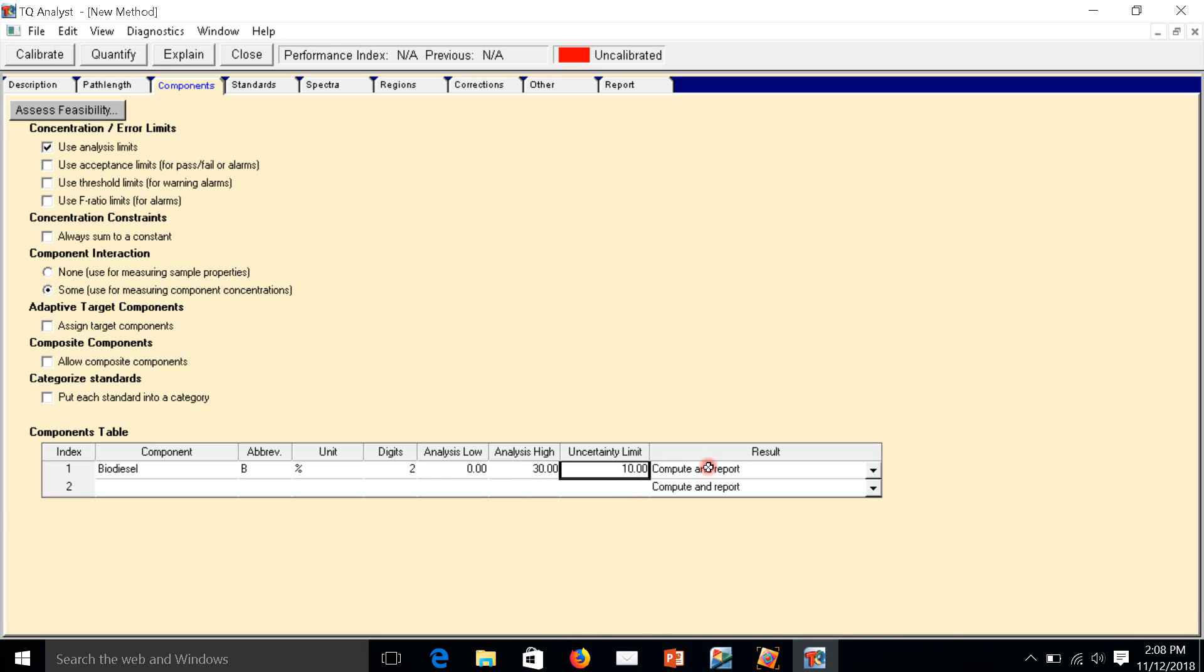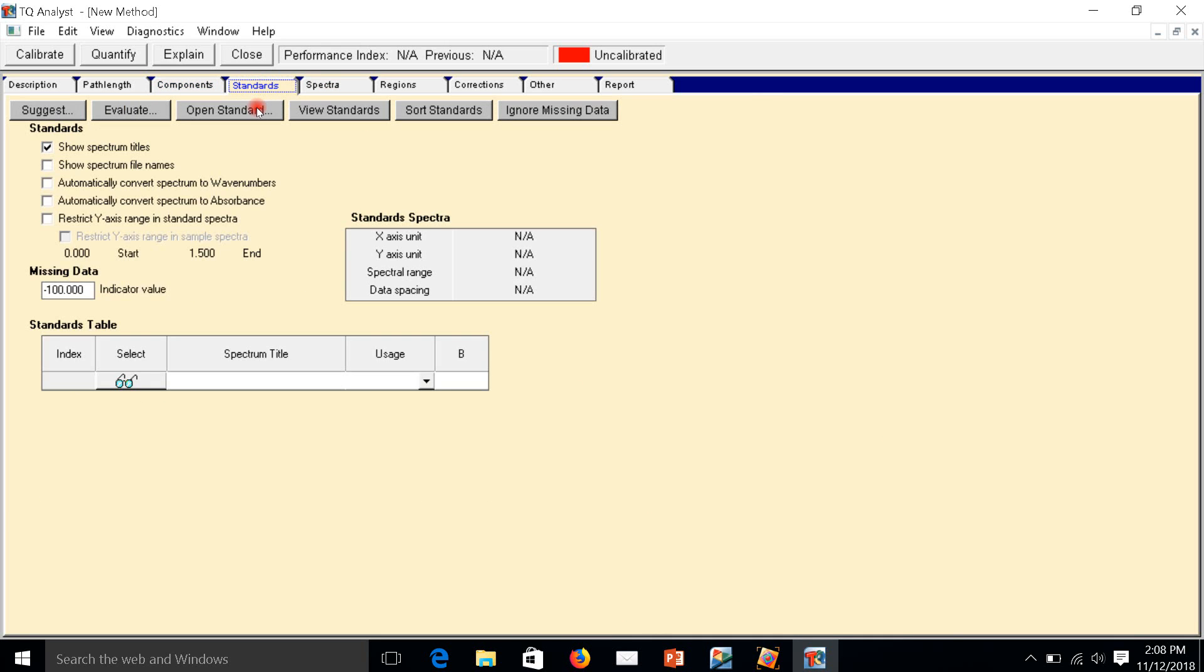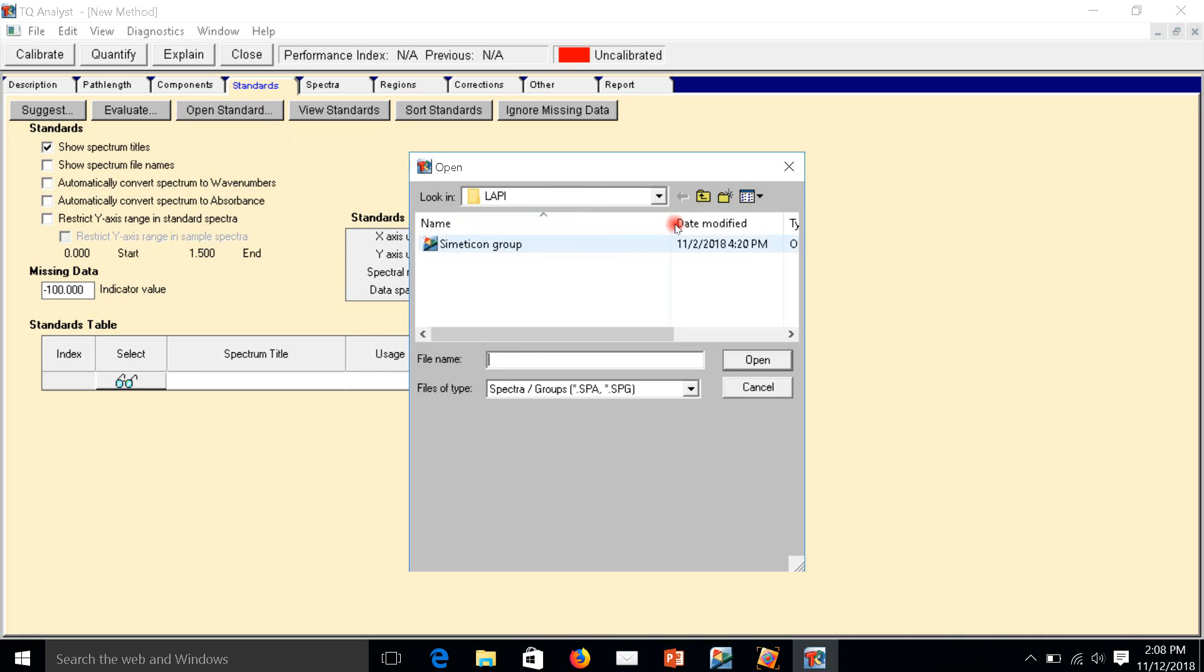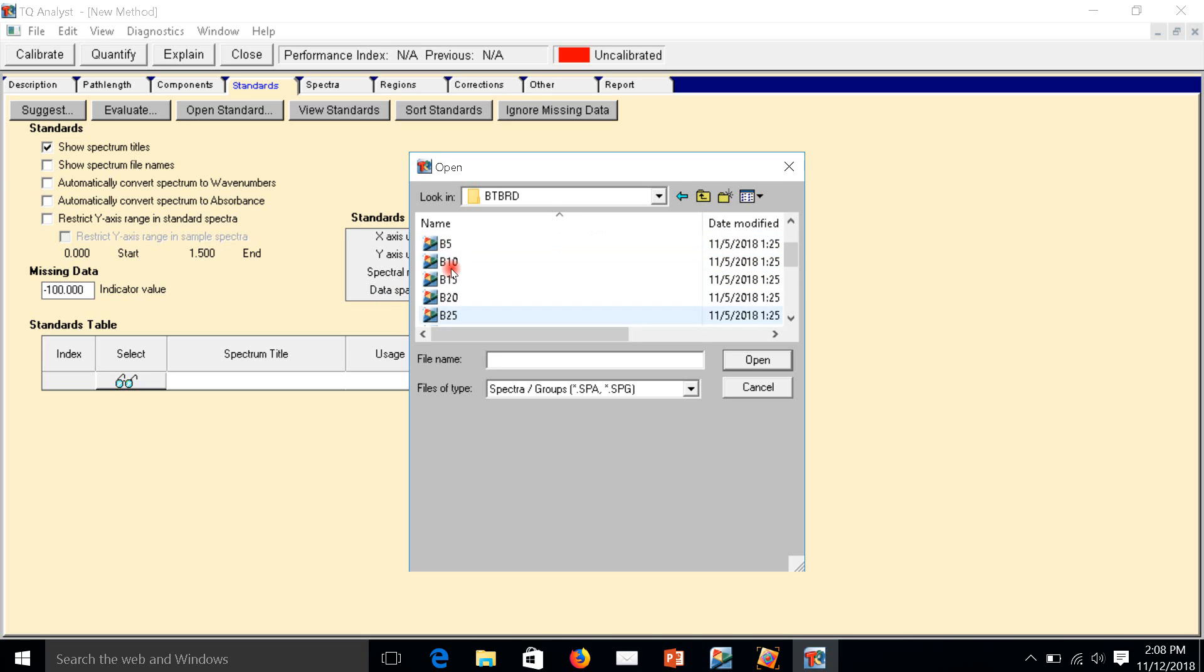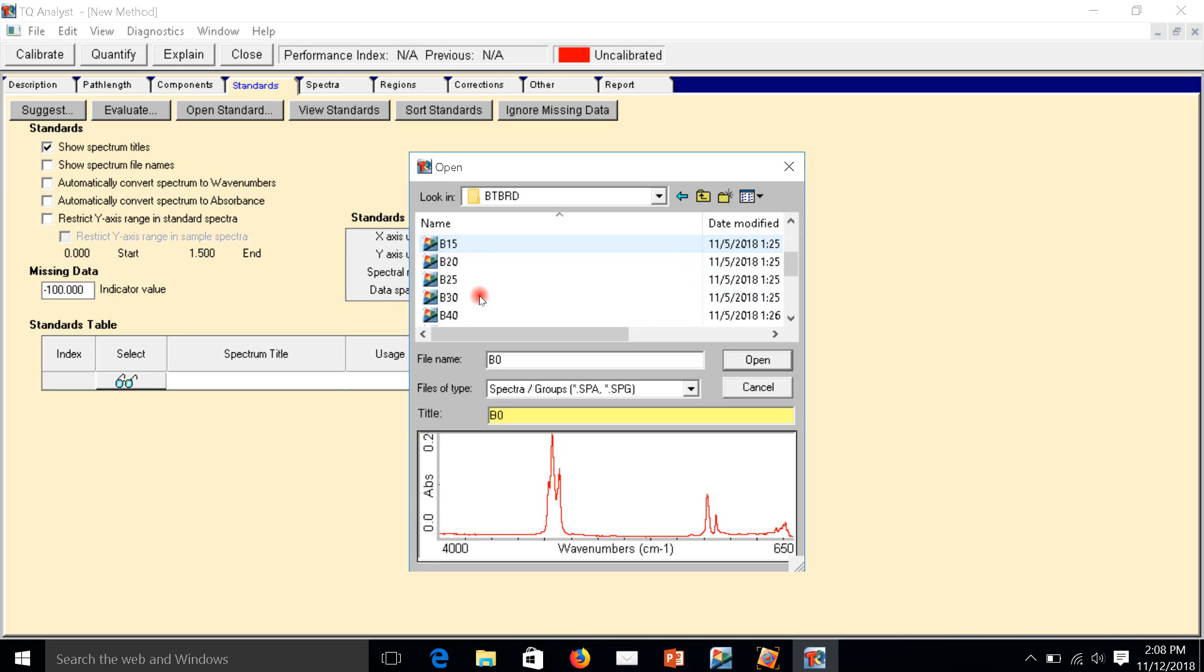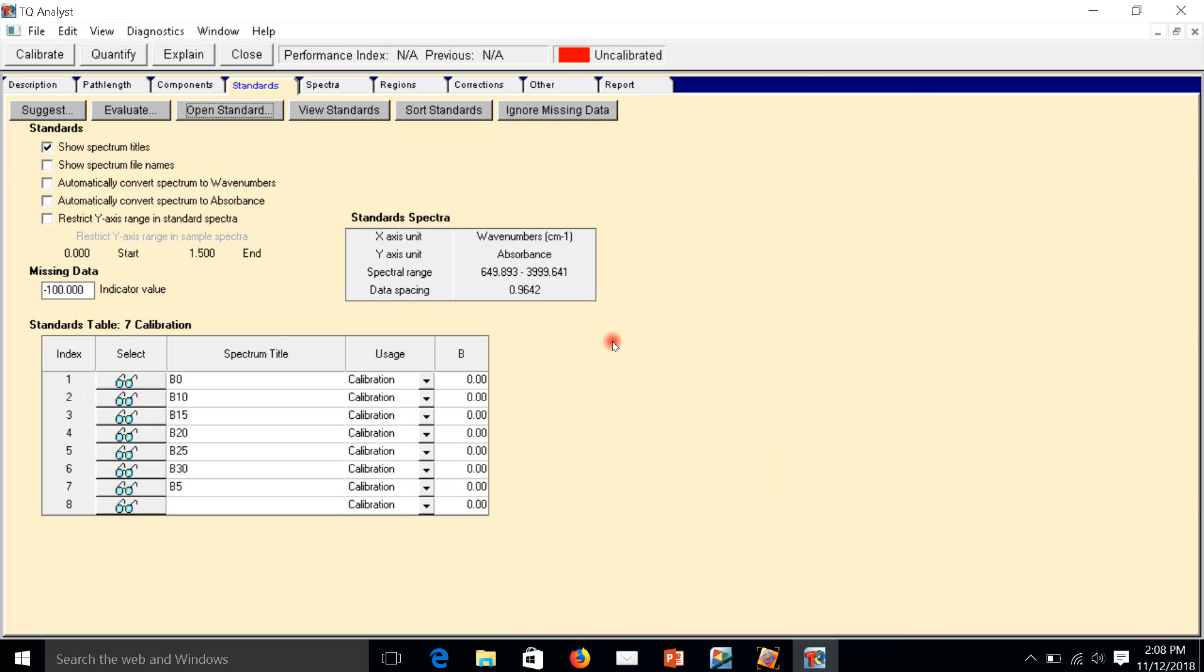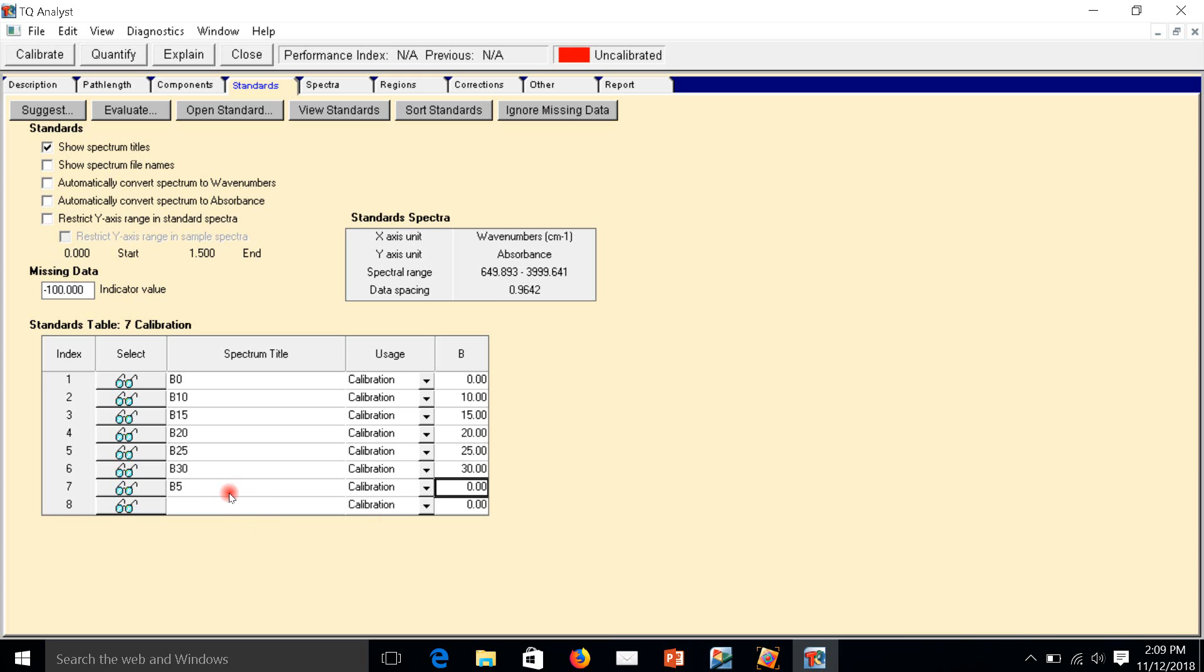We have to open standards. It means spectra we already scanned with our FTIR. Open standard, this one is B0 to B30. I open it, and here we have to write down the values. B10 we write down 10, B15 is 15, B20 is 20, B25 is 25. Sometimes the value is not sorted from lower value to higher value, but it's normal.